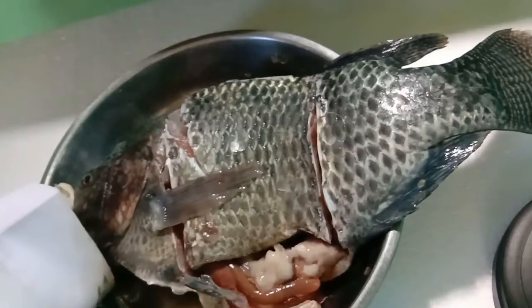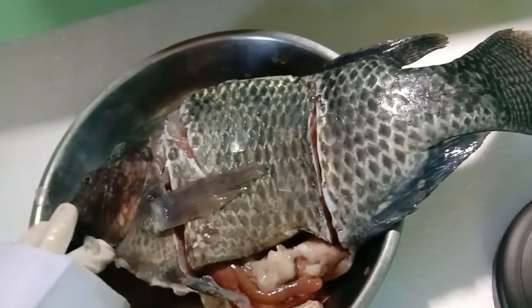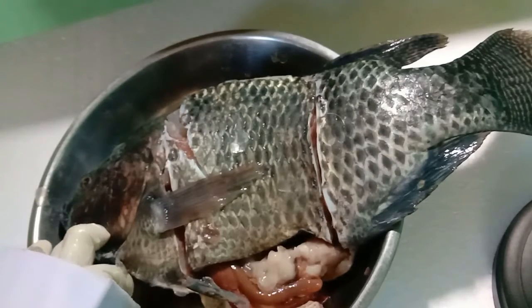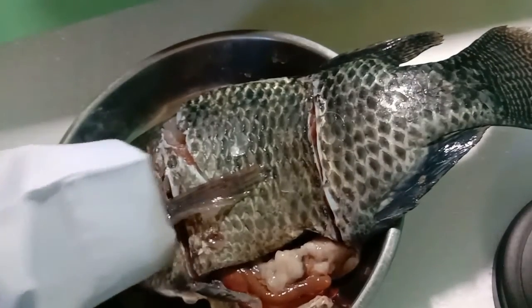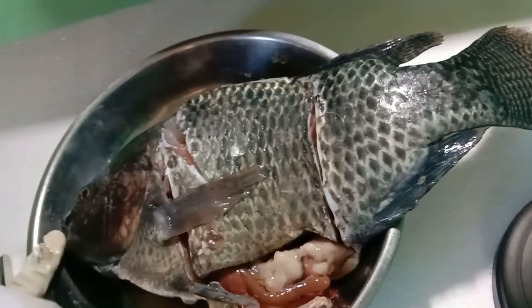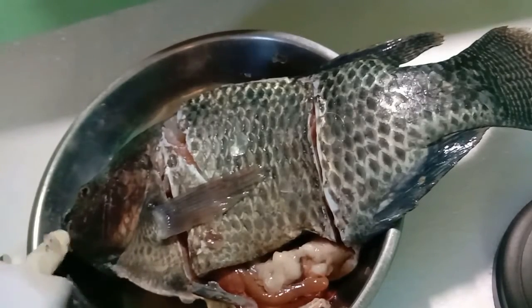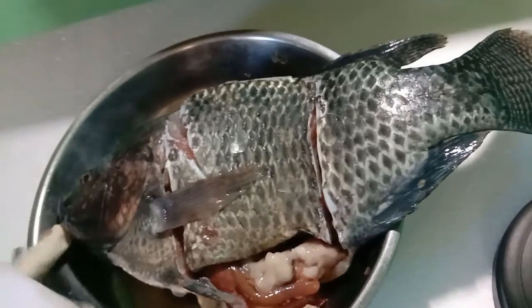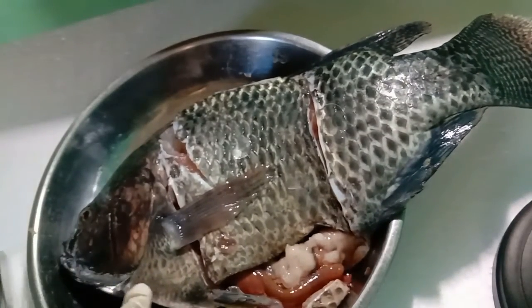Next is the sternohyoid muscle. Based on its size, this muscle can potentially contribute to the overall power required for suction feeding. The sternohyoid muscle is in here, contributing to the overall power required for suction feeding, like chewing. So the muscle is from here.